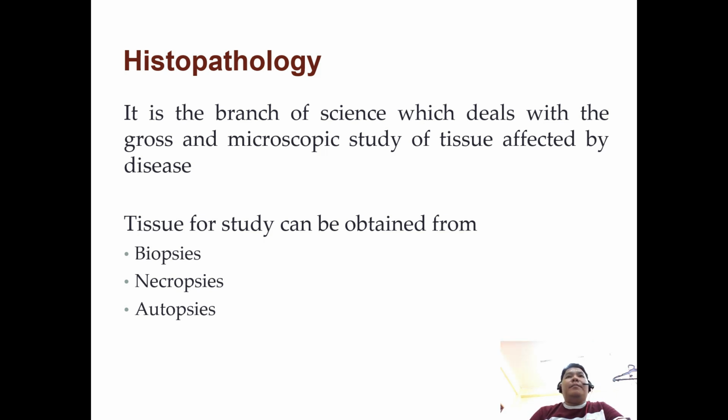In another meaning, we need to know the effect brought by the organism to the tissues of the animal. Histopath is also used for diagnosing tumors and identifying the nature of it, whether it is cancerous or not. So in histopath, this involves more on the tissues.